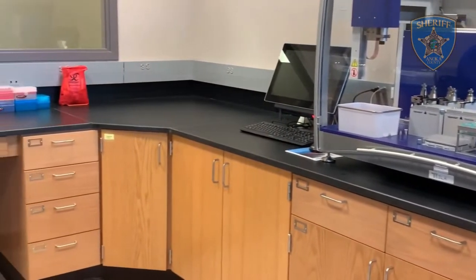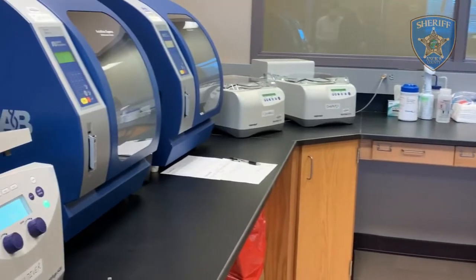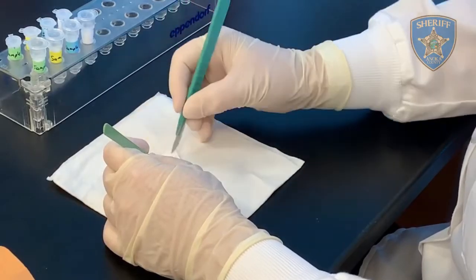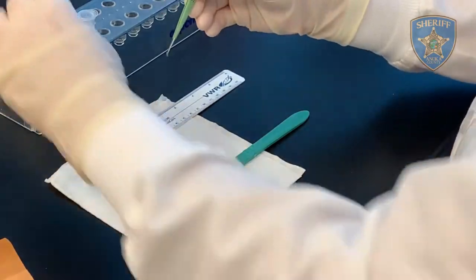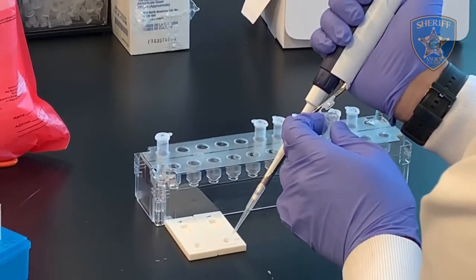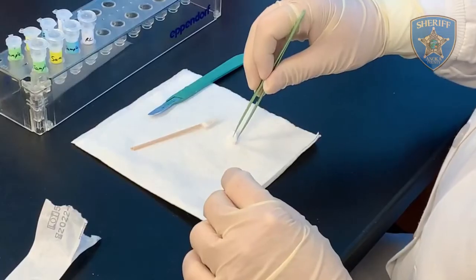Biological evidence can be a crucial piece of data to solve severe crimes such as sexual assault and homicide. The biology section of the Midwest Regional Forensic Lab is able to test samples of evidence that are less than half of the size of this blood sample. The first step in this process is for the serology scientists to test evidence for pertinent DNA samples. Once these samples have been identified, they are given to a DNA analyst for testing.